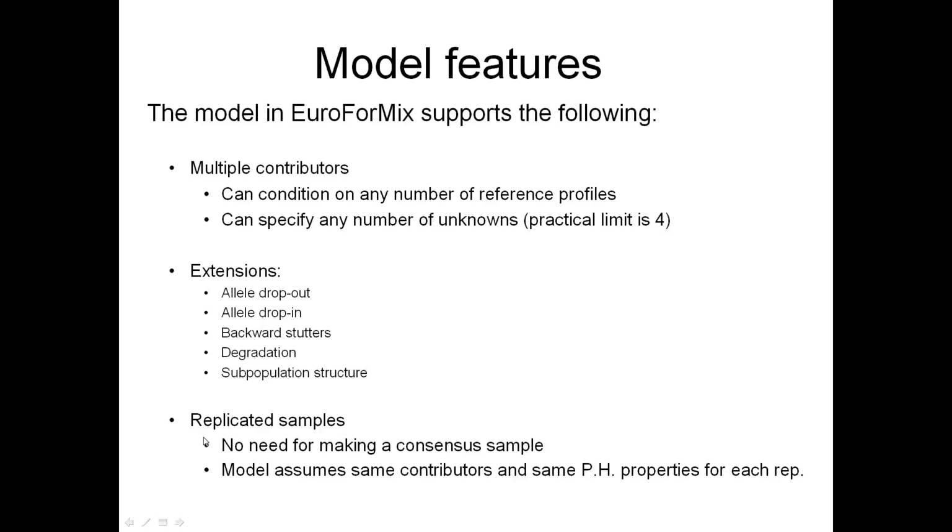So EuroForMix can also handle replicated samples, and this means that you don't need to make a consensus sample. However, the model assumes the same contributors and also the same peak height properties for each replicate.